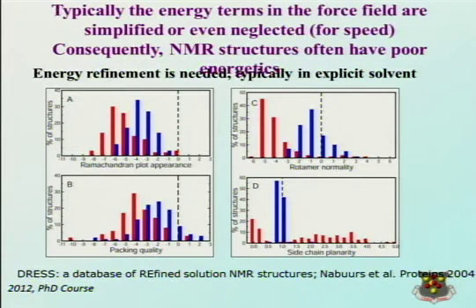You actually can measure the deviation of the Ramachandran plot of your protein with respect to expectations given what you see for high quality X-ray structures, which would be the line here. And the red is what you have in the database. So this is measuring standard deviations.